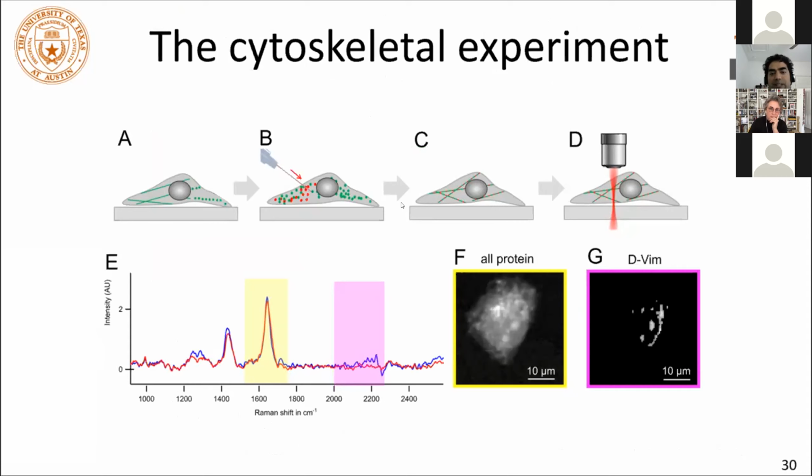So now let's go back to the actual experiment we wanted to do. This experiment was basically a parallel to what was done in the mid to late 2000s, so around 2004, 2007 or so, by the Danuser group, where they were injecting a lot of fluorescent labeled actin into cells to do fluorescent speckle microscopy.